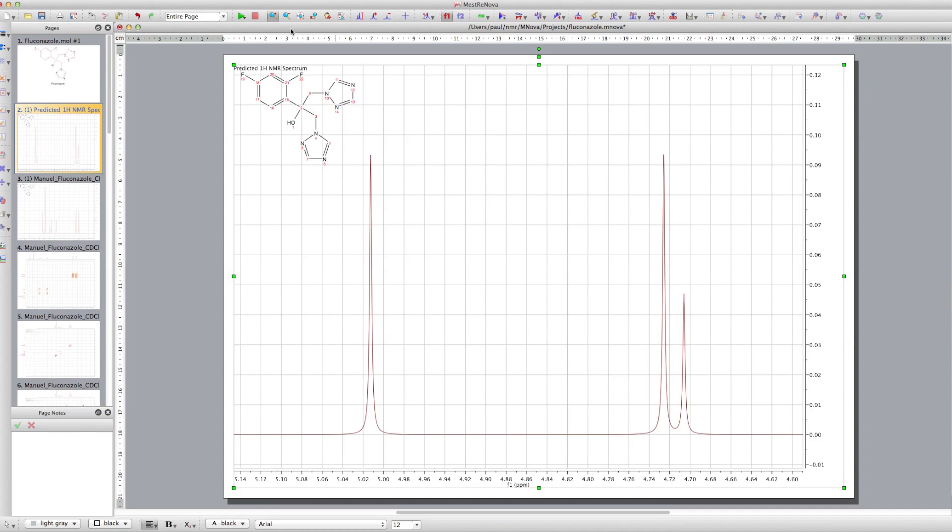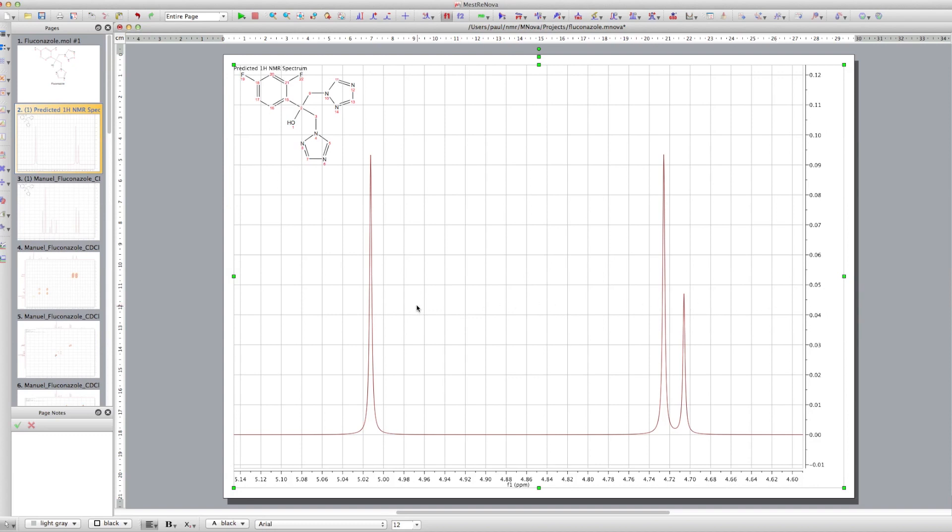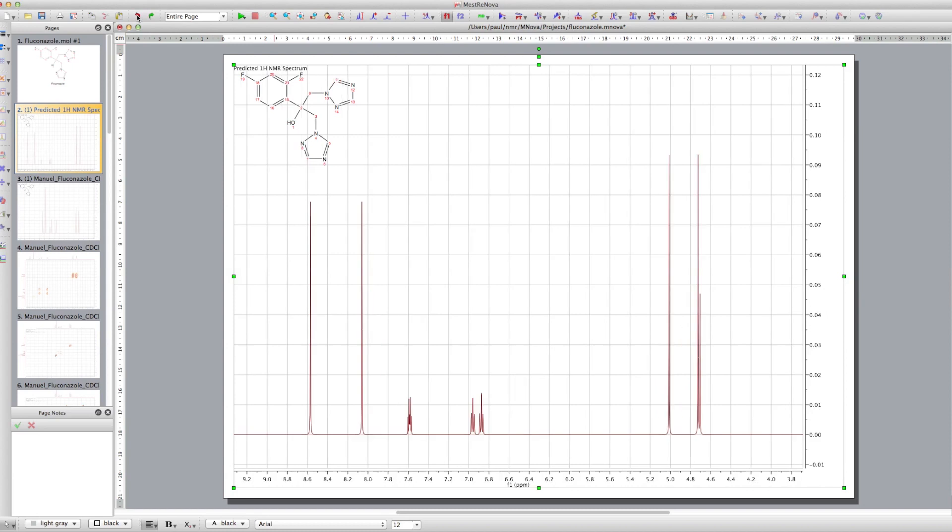You can see the OH peak there. And of course, depending on the solvent you're in, that's going to move up and down as it's hydrogen bonded. The hydrogen bonding takes electron density away from that proton, so it will shift around a little bit.